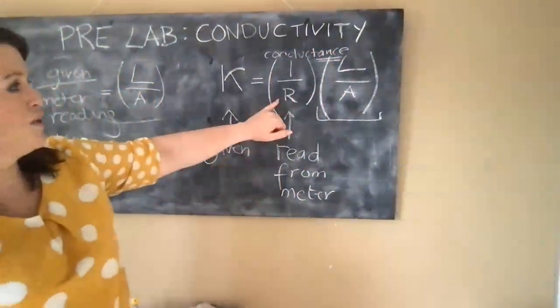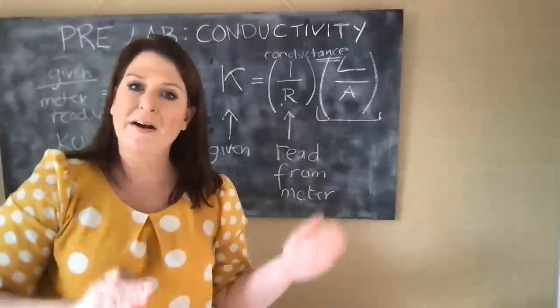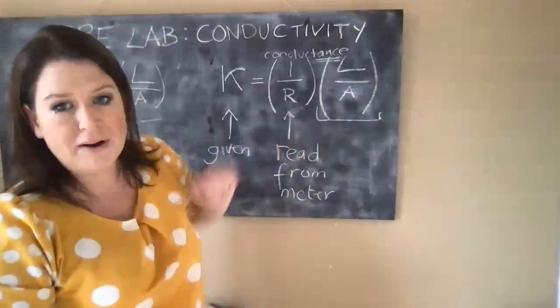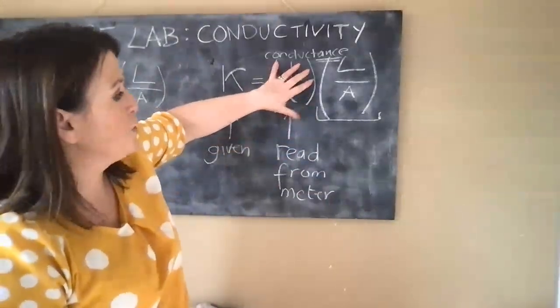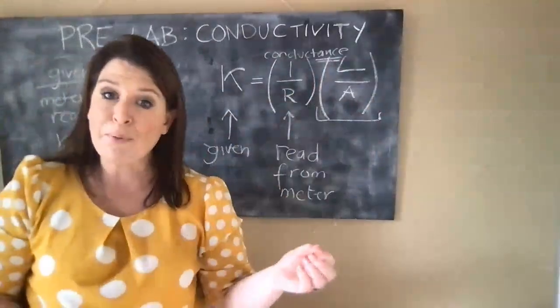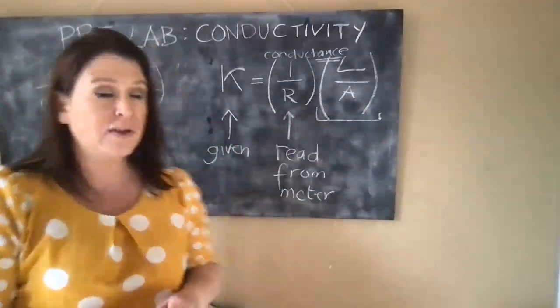To convert conductance to a standardized format of conductivity that can be compared to anybody who's using any different equipment, you need to multiply it by your cell constant. When you're presenting your data, you need to take the reading that you get for that particular solution and multiply it by this cell constant. Remember that you're using the same probe for the duration. So once you've calculated this once, they are the dimensions that you're using all the way through.